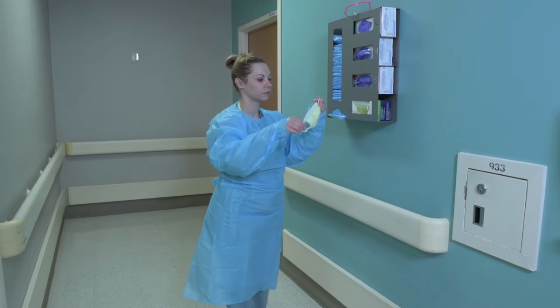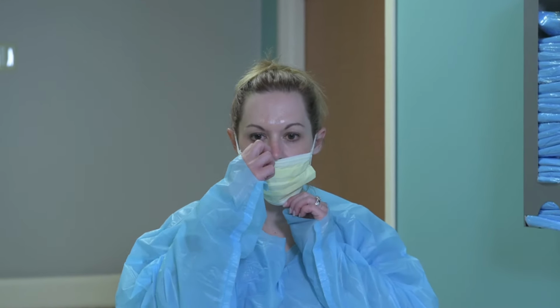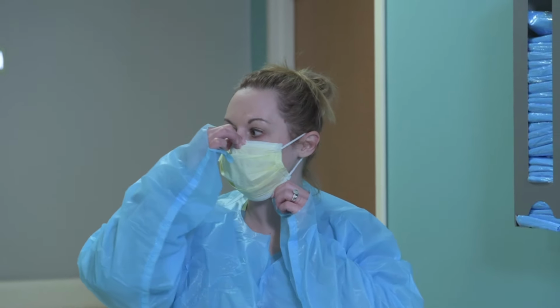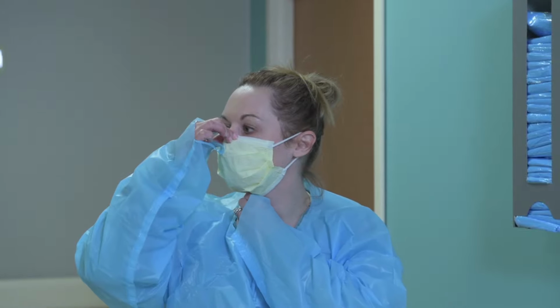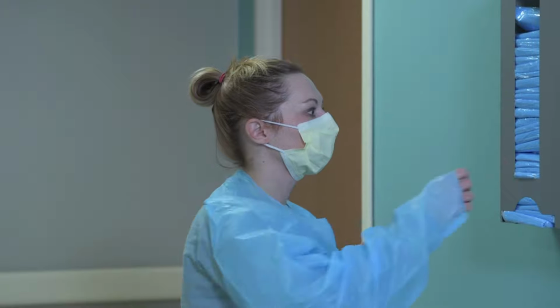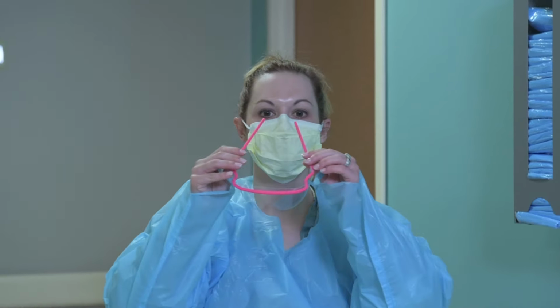Masks are worn to prevent blood and body fluid exposures to your mucous membranes in the event of a splash. Masks are also to be worn by employees in patient rooms where droplet precautions are being observed. This is to prevent contact with droplets that are projected into the air following a cough or a sneeze.